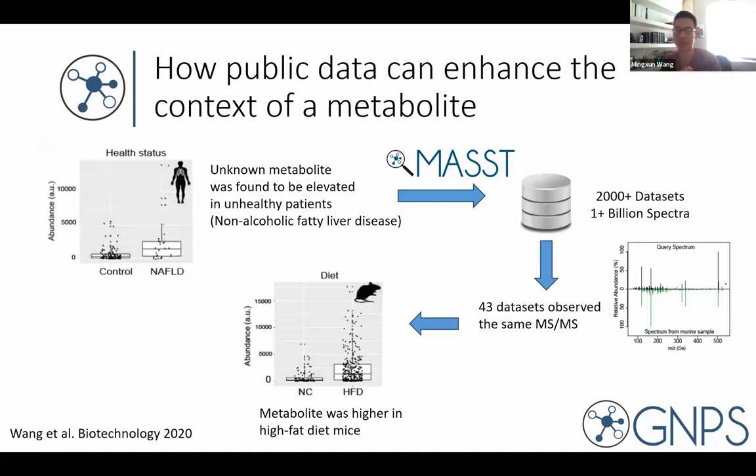And then some collaborators, this was done with Peter's group, did the discovery work, and they solved the structure. They hypothesized that it was actually being synthesized by the microbiome in the gut, and it has some implications for liver health. So bile acids are involved in that direction. But the bottom line is we started with a hypothesis in our own data, and we were able to gain a little more context and corroboration even before we could identify what the molecule was, by leveraging all this public data that was available.